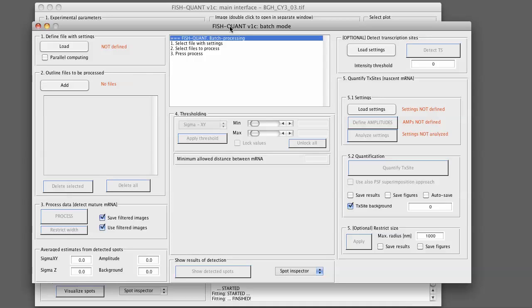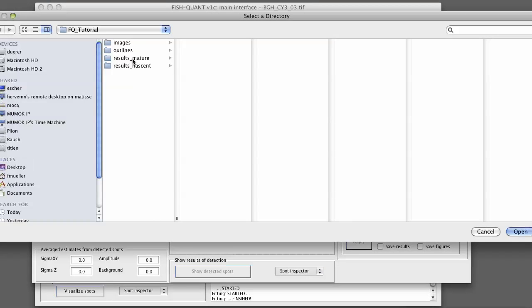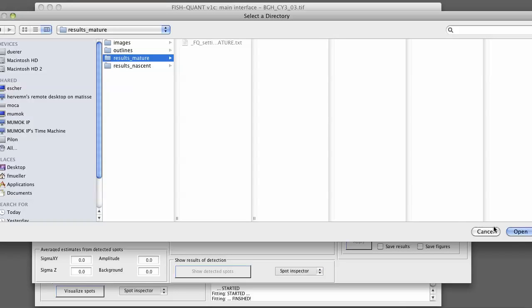As in the main interface you also have to define a folder structure. This folder structure is independent of the main interface so you can work on two different things at the same time. You go to folders. Here we use the same folders then in the main menu so we select use folders from FQ main. What we now also define is the folders for the results. Take results mature.